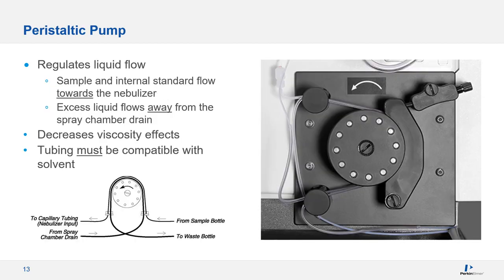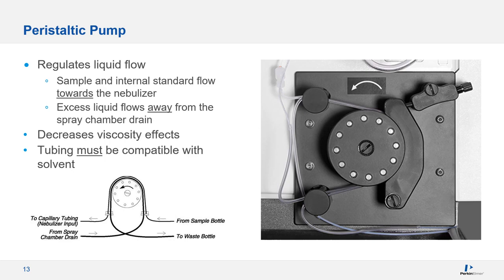One of the first steps in any analysis is getting the sample to the plasma. A critical piece of this process is the peristaltic pump, which is used to deliver a constant flow of sample to the plasma. If your peristaltic pump isn't delivering a constant flow, then you'll have problems.